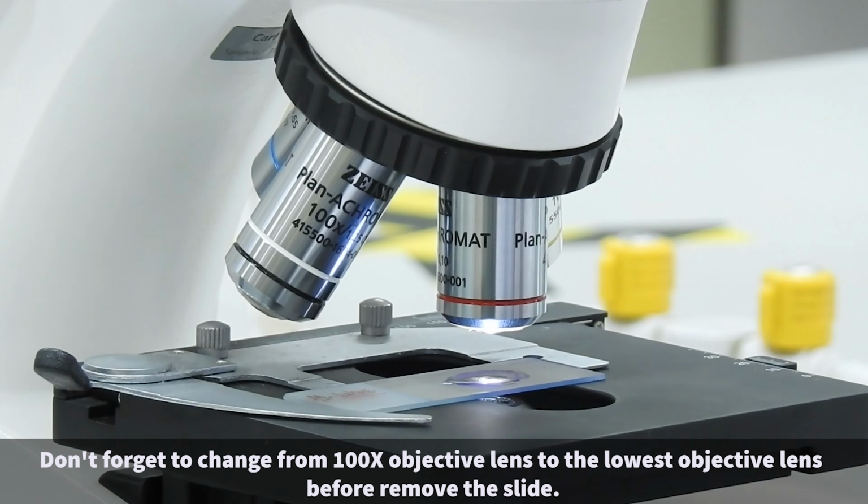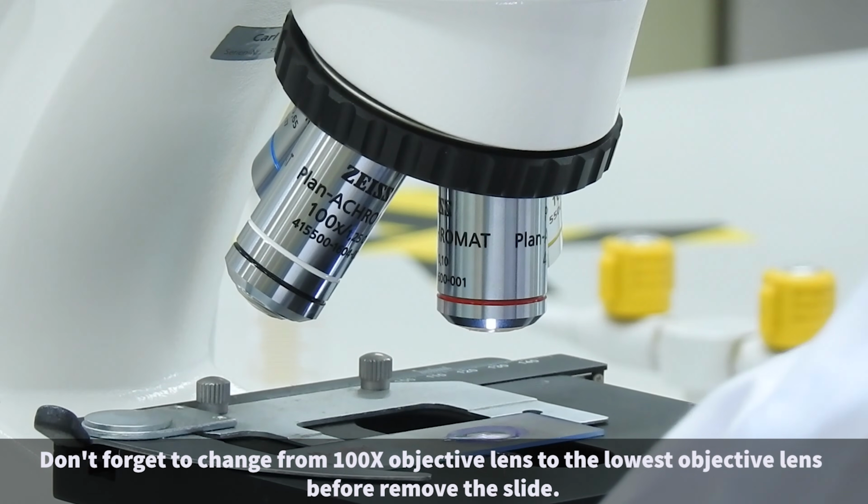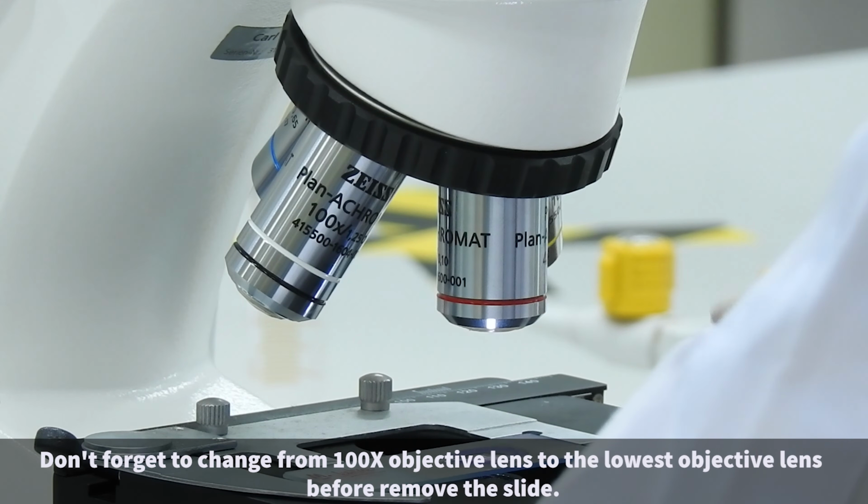Don't forget to change from 100x objective lens to the lowest objective lens before removing the slide.